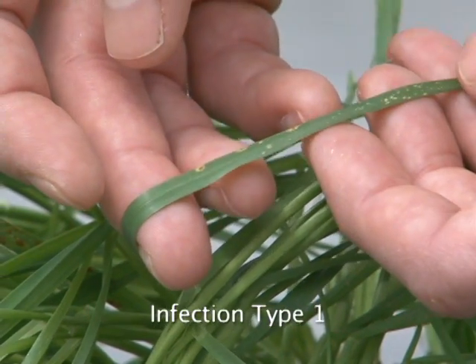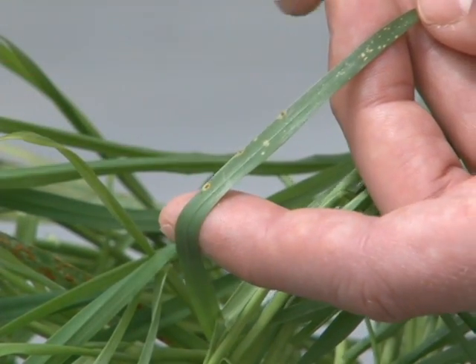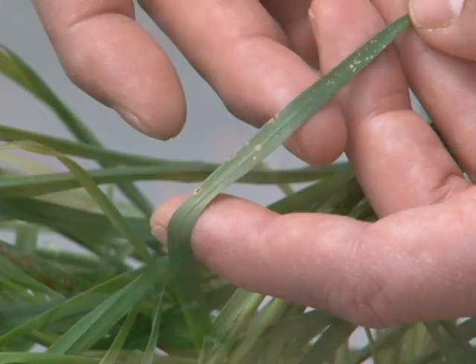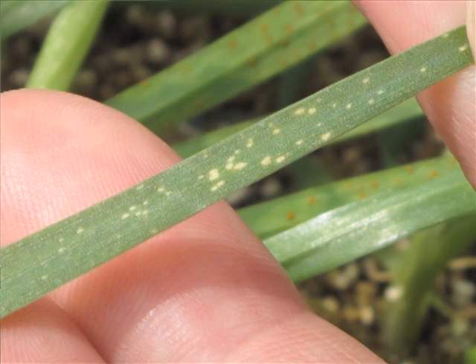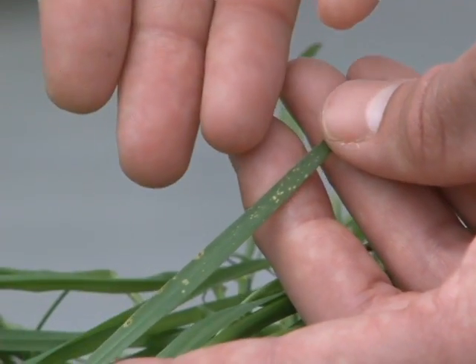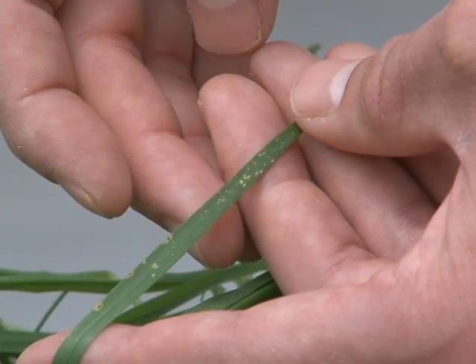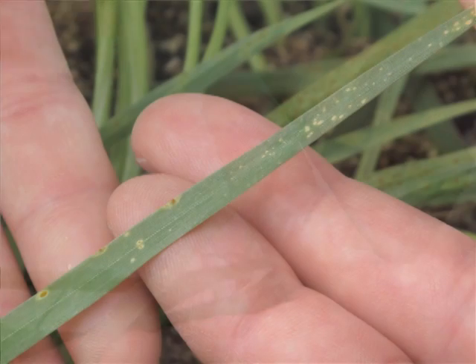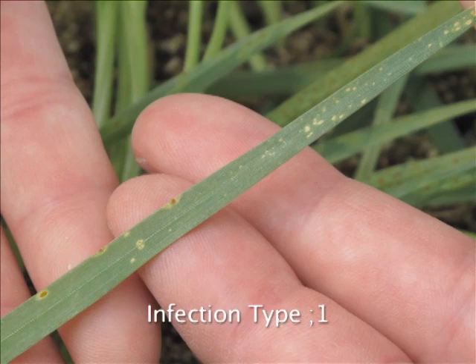For SR38, there are more infection types than just one on the same leaf. You can see these yellow spots, which are spots of chlorosis. We call this a fleck infection type. Fleck infection types are in between a one and a zero — the rust has begun to infect the plant, but the plant has killed all the cells in the vicinity of the infection. So for SR38, we call the overall infection type a fleck-one infection type.